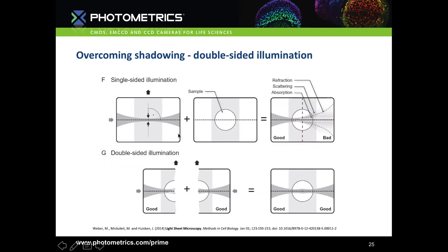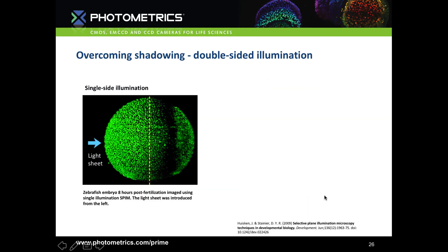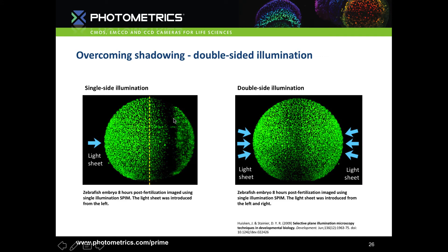Another way is to use double-sided illumination, where a lightsheet is introduced from both the left and right sides of the sample simultaneously to cover the area of poor image quality caused by light refraction, scattering, absorption and shadowing. In the single-sided image the lightsheet doesn't penetrate the entire zebrafish embryo and the other half becomes blurry and patchy, but with a lightsheet from both sides, almost even illumination of the embryo is achieved — a really big advantage of lightsheet microscopy.